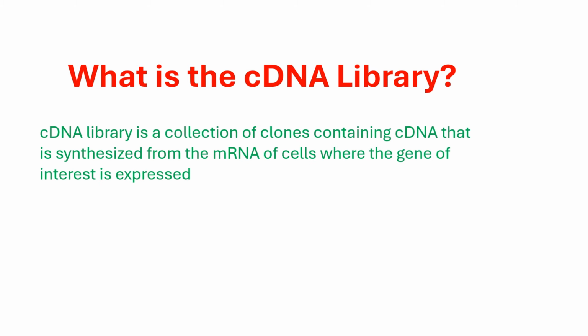A cDNA library is a collection of clones containing cDNA that is synthesized from the mRNA of cells where the gene of interest is expressed. The main emphasis is on the cells where the gene of interest is expressed. That is why, when I started, I said that you have to target the cell in which your gene of interest is expressed, and then extract mRNA from that particular cell before you can obtain a complementary DNA form of the gene that you are interested in studying.